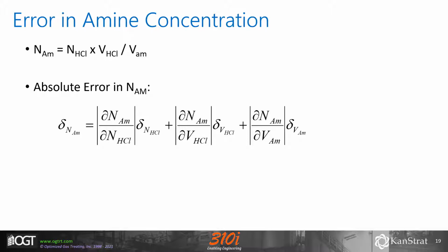The error in titer normality is usually small, but related to diluting a known standard of hydrochloric acid in a measurement flask, which is of known error. The titer volume error depends upon the size of the titration burette compared to how much sample was delivered from the burette. Typically, a difference is taken of 2 readings of known uncertainty.